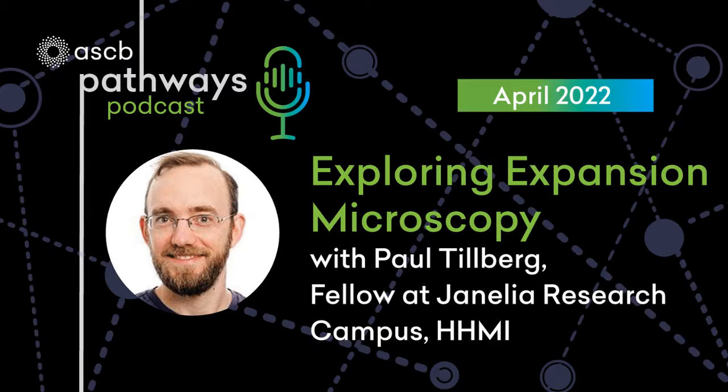What we thought was, could we use expansion instead of electron microscopy? And we're not going to try to get every single neuron, but we're going to try to get defined subsets of neurons. And if we can resolve the connections between those subsets of neurons, we could get maybe a limited or a sparse connectome, but do it for a much greater number of animals. And so Josh has spearheaded using that technique, and this is out on bioRxiv now.